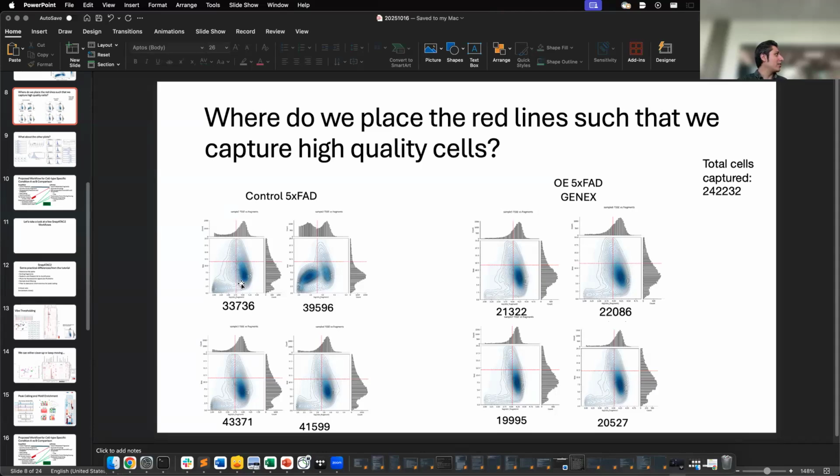And then at the bottom of this, there's another valley to look out for. That's what I've been using for the bottom of the QC, if you will. I don't know if that's the best approach, but that's the approach I've been using. Seems to be working okay.